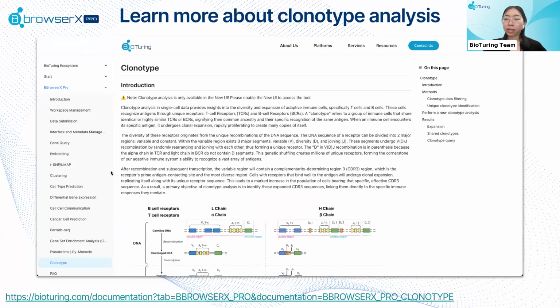Okay, and so that is the end for how you can use the clonotype analysis tool here on BBrowserX Pro. If you want to learn more about the analytical tool, we also have our documentation page, which dives into the methods of how we perform the data filtering on our tool, and also how you can define what a unique clonotype is. It also shows you how to interpret the results again.